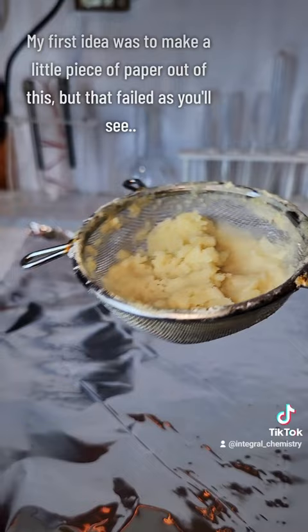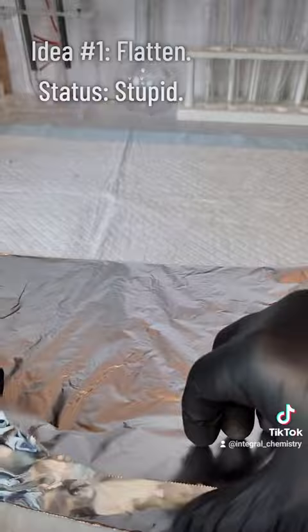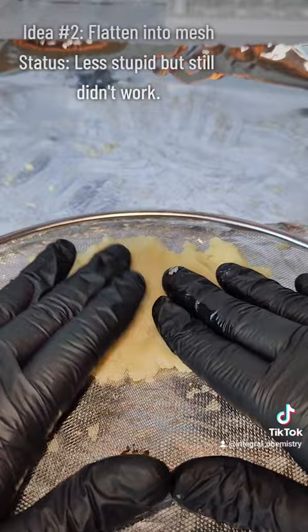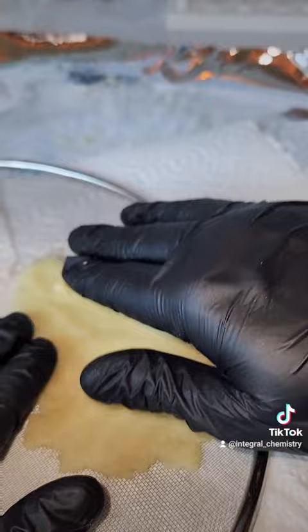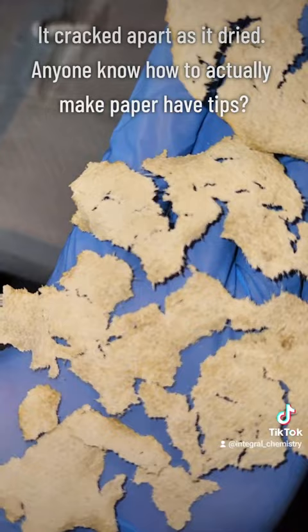My original idea for this project was to make this cellulose into a little piece of paper, but I'm a chemist, not really a paper maker, and it didn't turn out very well. My first idea was to just flatten it, which didn't work — it was pretty stupid. My second idea was to flatten it into a mesh, which was also stupid and didn't work, but it was a little better. The reason the second method didn't work is that as the cellulose dried, it contracted and cracked apart. You'll also notice that the cellulose here is not paper white and has some discoloration, which has everything to do with the very extreme discoloration of my starting material.